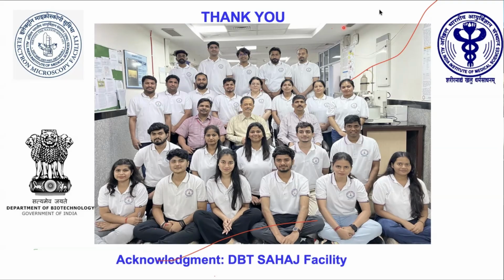It's older blocks which were used for TEM. We standardized this technology for our machines and for our samples, and we are getting the data. And very nice images you can see now.